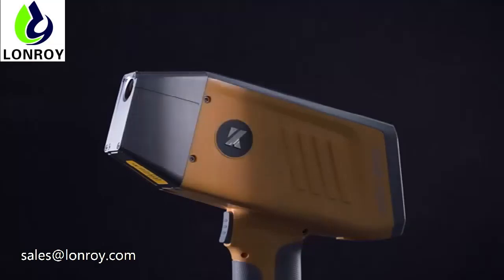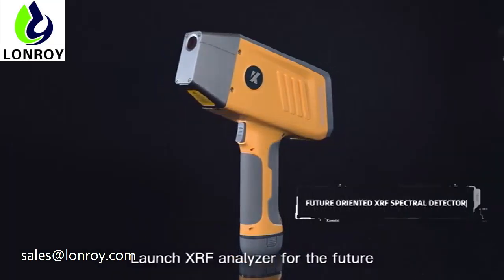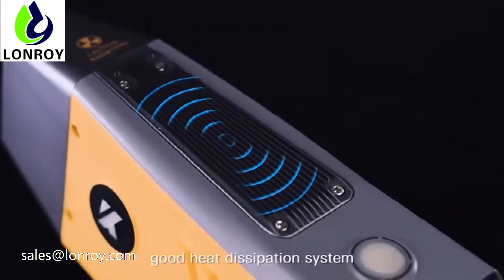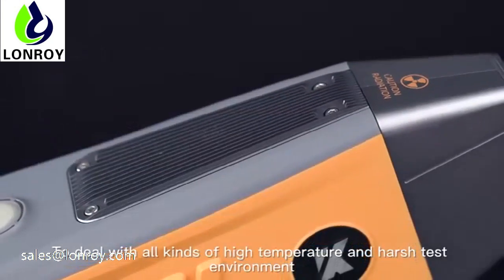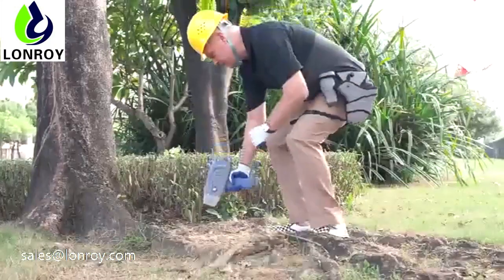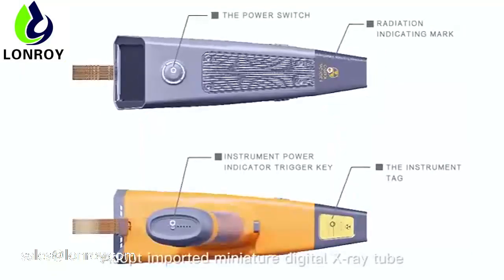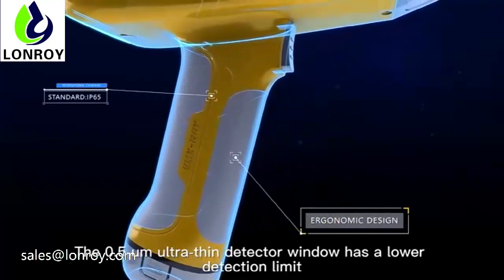KM X-ray XRF analyzer for the future: excellent industrial design with aviation-grade aluminum-magnesium alloy, good heat dissipation system to deal with all kinds of high-temperature and harsh test environments. Portable and fast, the ultra-narrow body is designed for tight test spaces. Adopts imported digital X-ray tube; the 0.5 μm ultra-thin detector window has a lower detection limit.